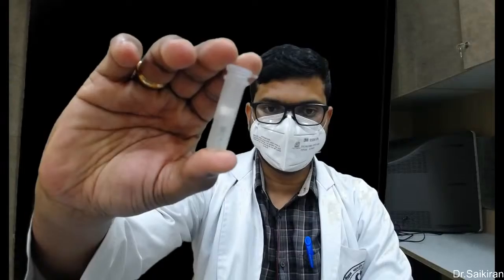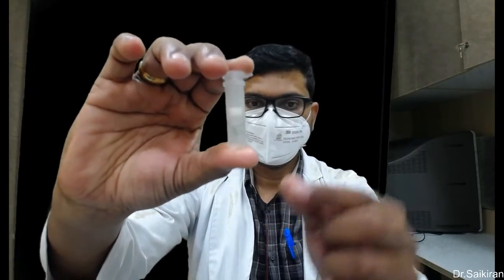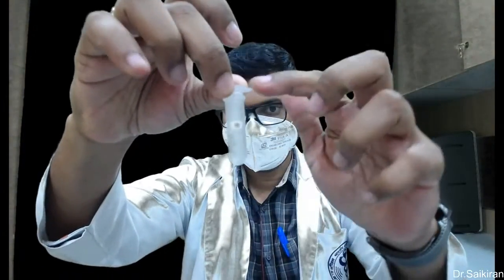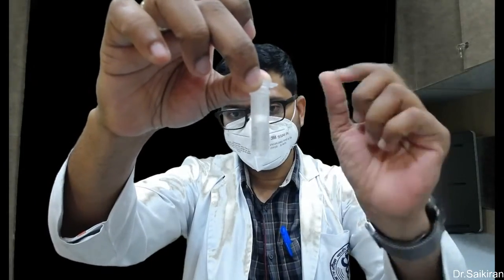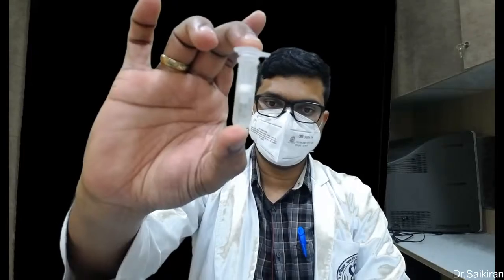Here, this is called as spin column, where this is used in the extraction procedure. Here all the DNA that is extracted gets filtered in this silica, and from which we can take the desired DNA. So this is called as spin column, that is used for extracting the DNA from the sample.